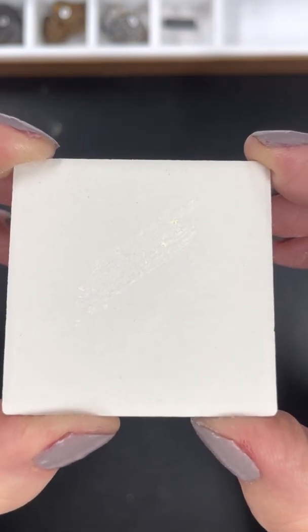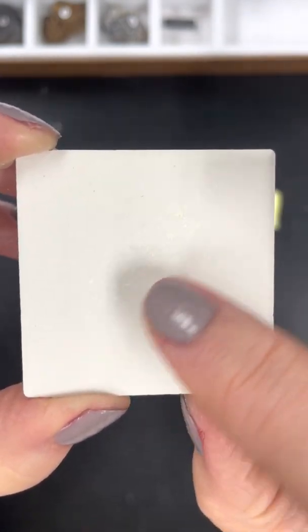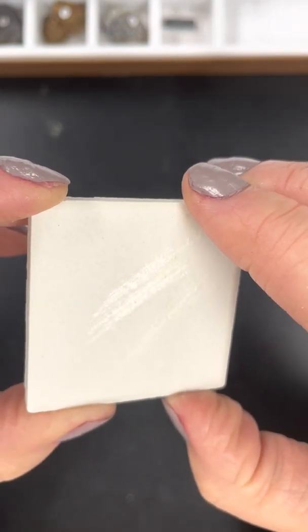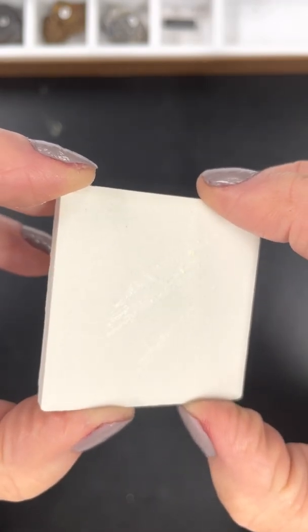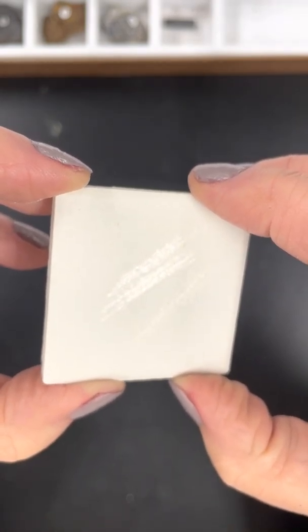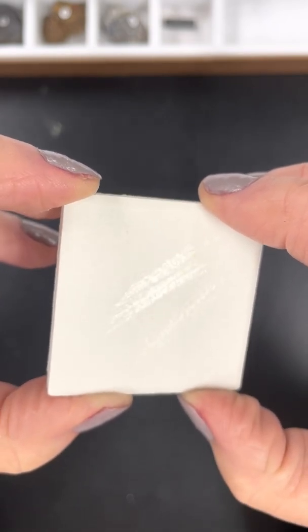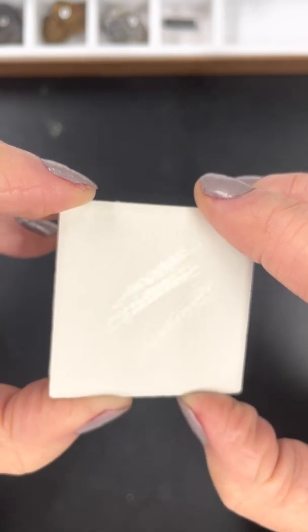And do you guys see that it's kind of white, kind of honestly translucent streak? There we go, see how that just doesn't have a yellow tint to it? So the streak would be colorless. It's not even really white. It's just kind of translucent or colorless.